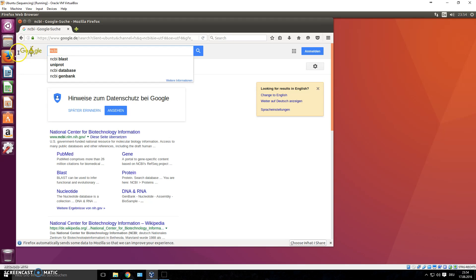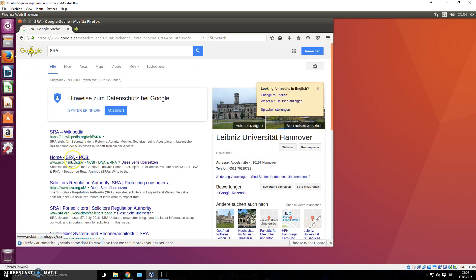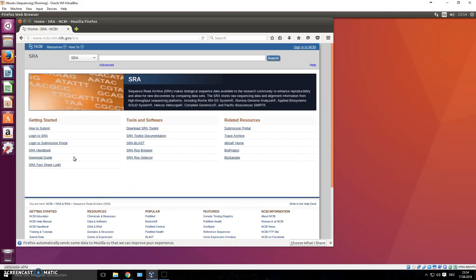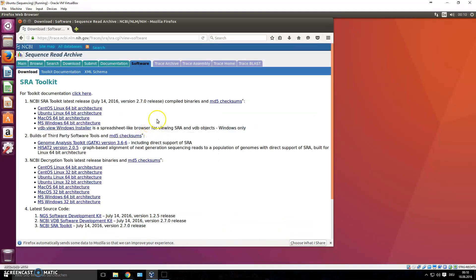The repository is called SRA — you can go there and you have the home of SRA. They have something called the SRA Toolkit. You need to download the toolkit, and with it you can download and convert SRA database files into FASTQ files. Anybody who publishes anything with sequencing has to upload their files to a repository like SRA or GEO, so others can verify their results. Click 'Download SRA Toolkit' and it takes you to the download page.